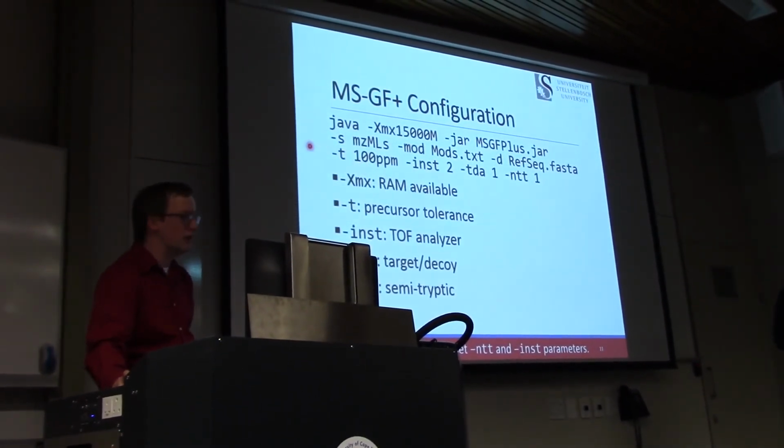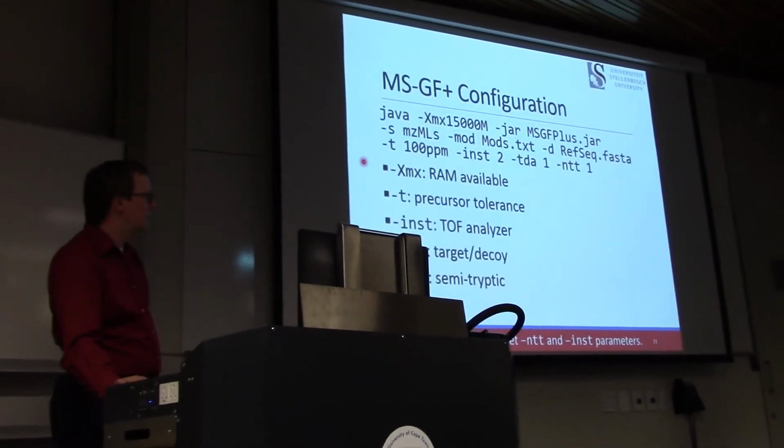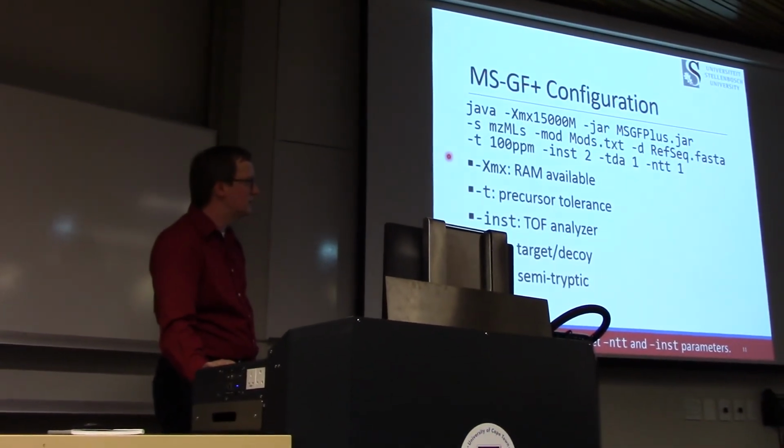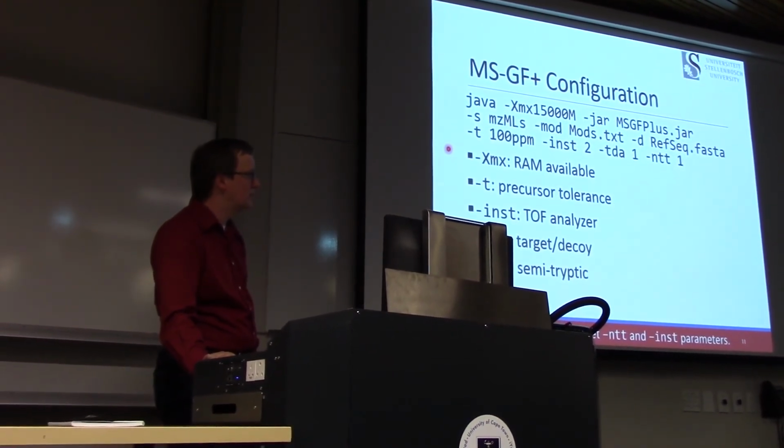Yeah, slightly lower. So I'm wondering not so much about the number of identifications, I'm thinking about the false discovery issue. I was controlling false discovery rate exactly the same way both times. But isn't your true false discovery rate likely to go up as you widen that mass tolerance window?